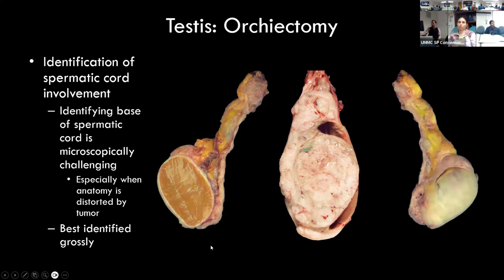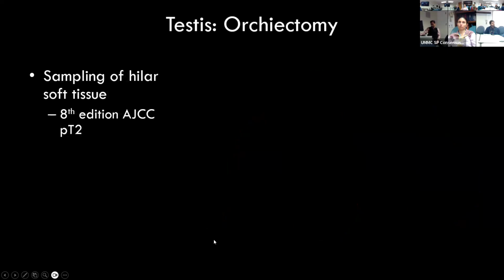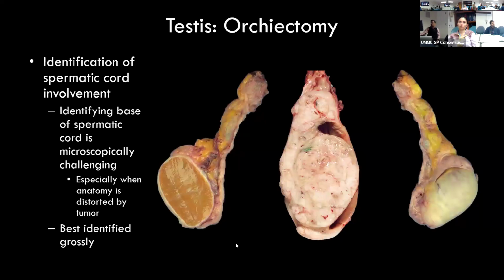So how do you identify that? What are the landmarks here? The landmarks are where the cord becomes a single structure, and I would say it starts right here. When this triangle becomes parallel like that, you draw a line straight there.